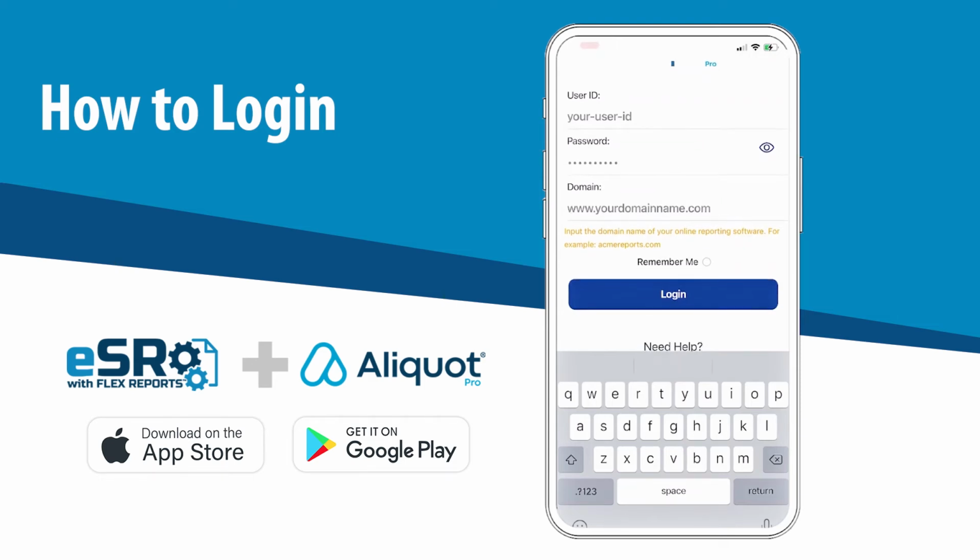In this video, I'm going to show you how to log into Aliquot Pro, so let's get started. Make sure that you can log into your site before attempting to log into Aliquot Pro. Please note that you will not be able to log into Aliquot Pro if your account is locked or if you are still using a temporary password.